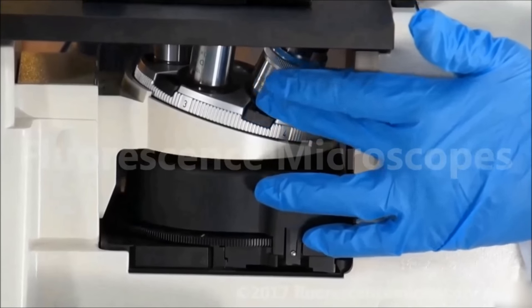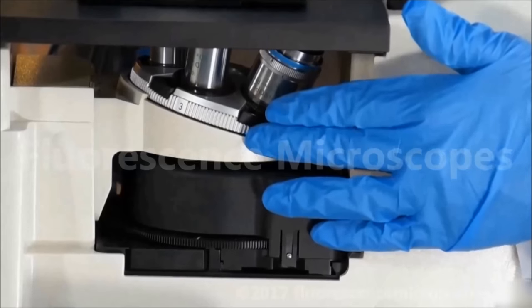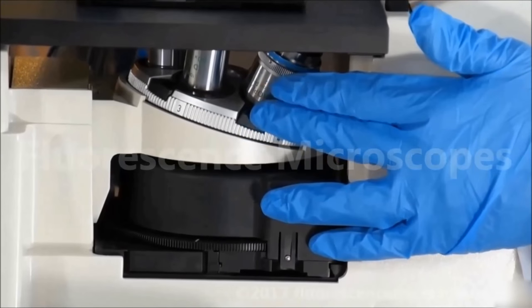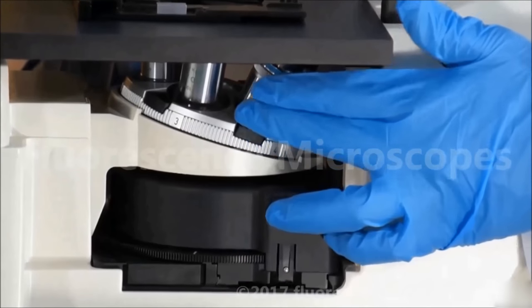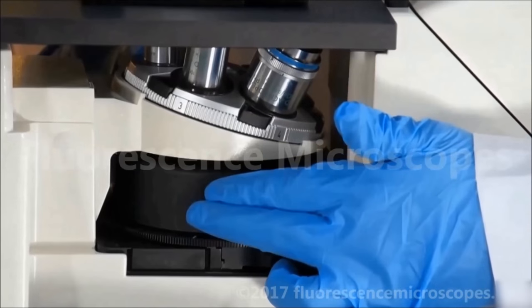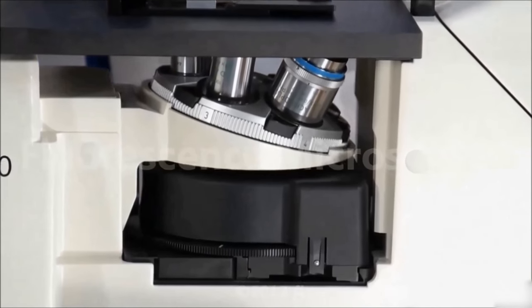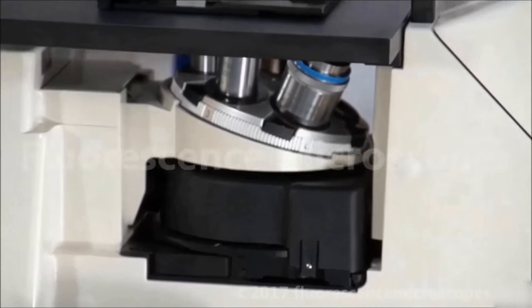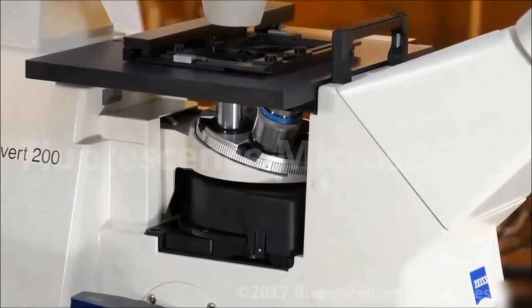This will be compared to a version that's... This is a 200, Axiovert 200, there's an Axiovert 200M, which you would have motorization on the objective turret, as well as the reflector turret, as well as shutters, fluorescent shutters. You can also do XY stages that are mechanical.